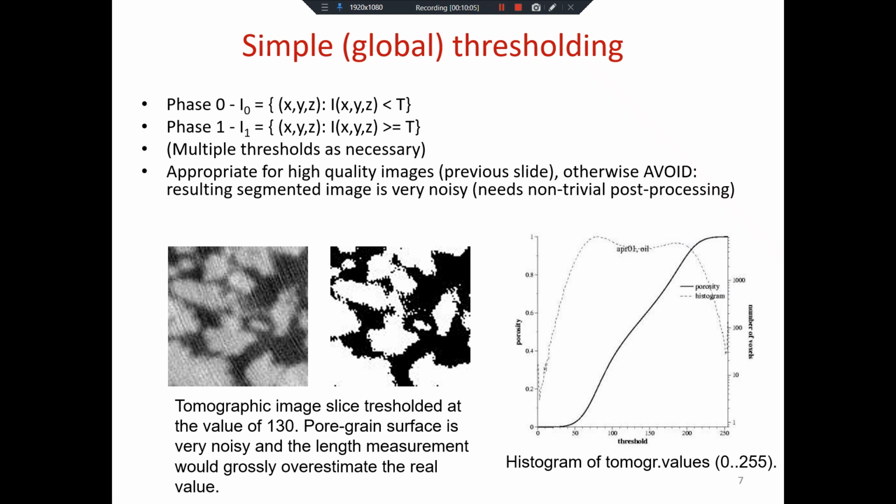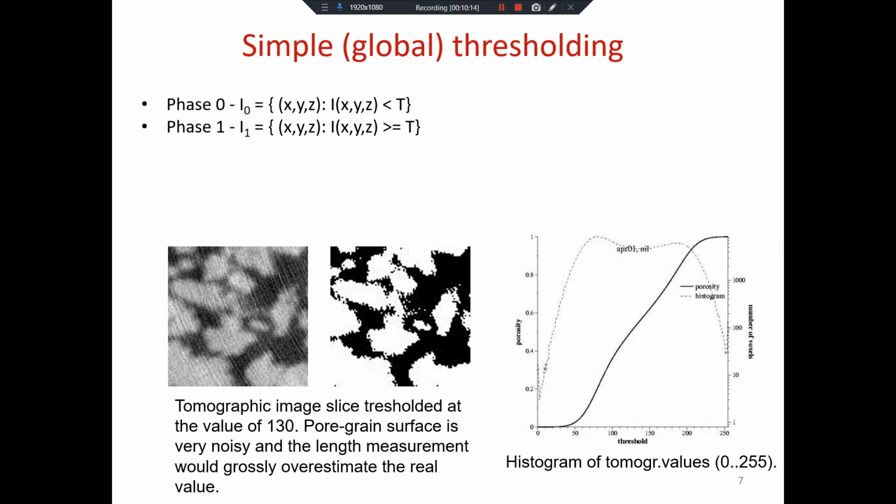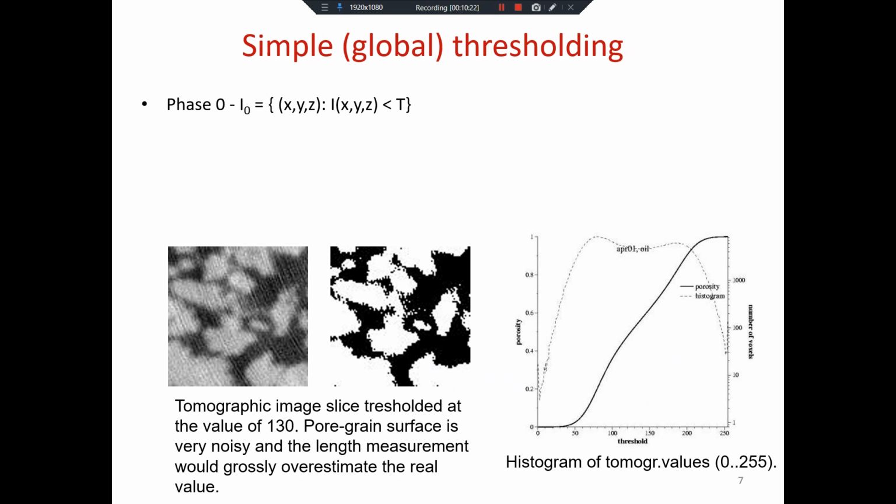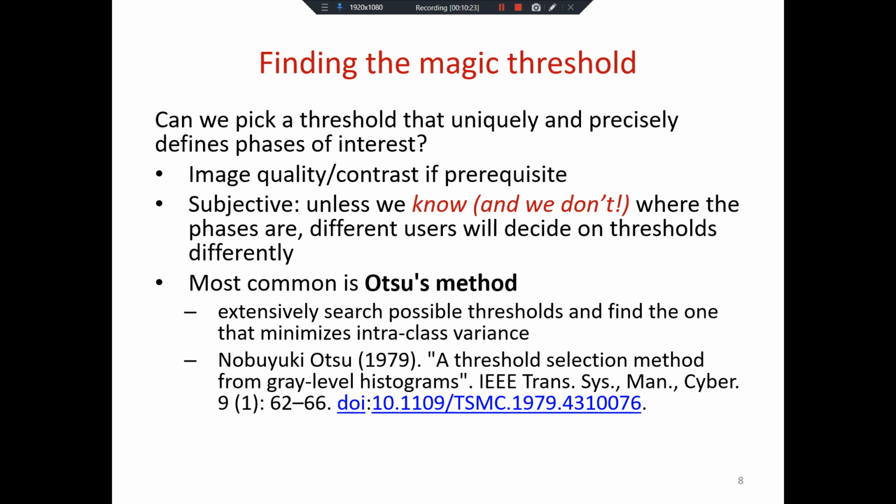Okay? But again, it's very easy to conceptualize. So if you have high quality images, yes, these are pretty good. Okay? Though we will actually use one of them as practice, so you will decide for yourself.